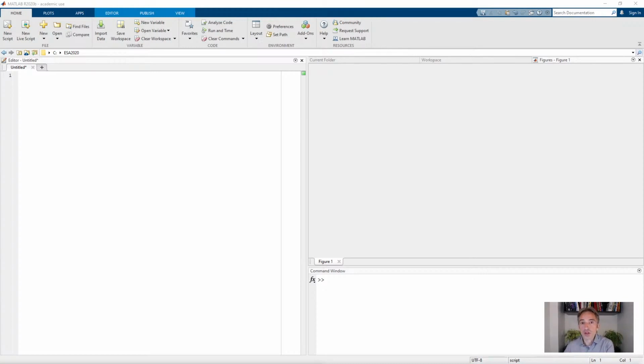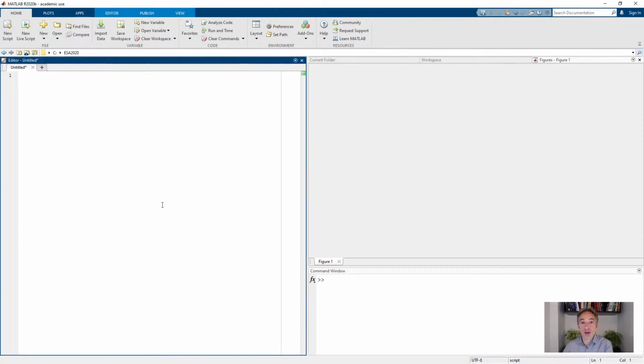So in this session, we're going to go over some of the basics of how EasySpin handles orientations. We're not going to do any simulation, but just talk about the various tool functions that are there to support thinking about and visualizing orientations.